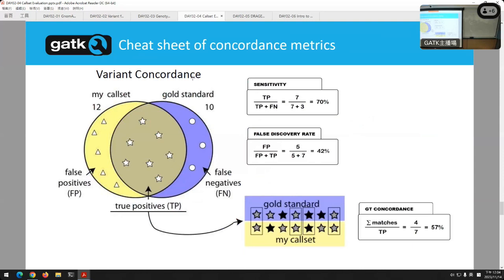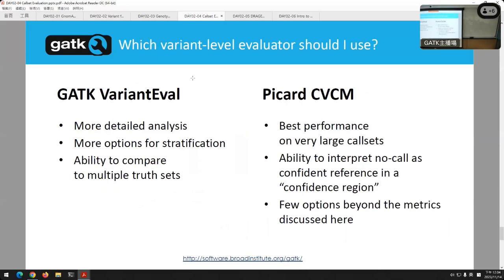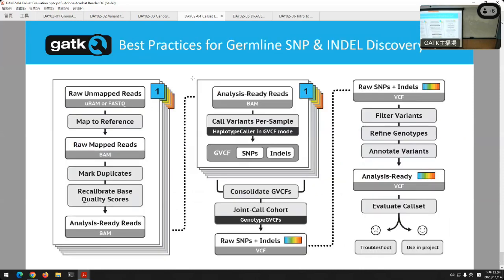All right. Because you have the slides, I don't have to go too much into the actual commands here. There are tools in Picard or inside of GATK, and we actually talk about why you might want to use one versus the other. But in the interest of lunch, I don't have to read everything on these slides. You have them yourselves. Those are basically four types of statistics that you can run. When you're done, ideally you look at your numbers and say, if you've chosen your truth set right, I know everything isn't 100% okay, but I have confidence that nothing egregious happened. And you can go from there.